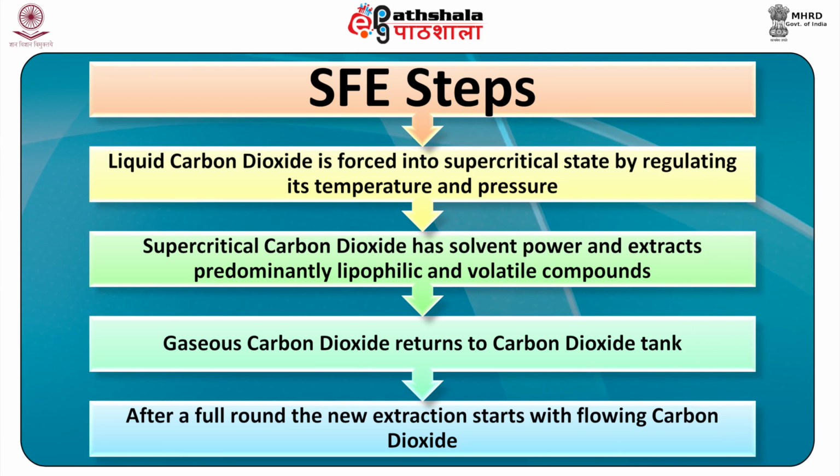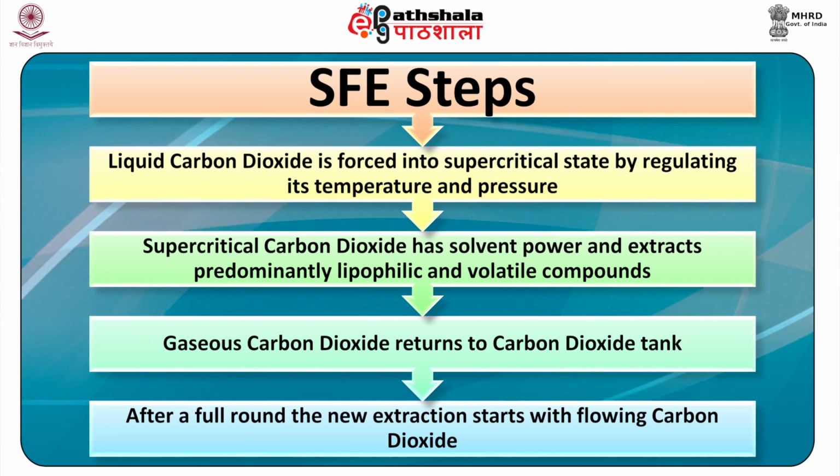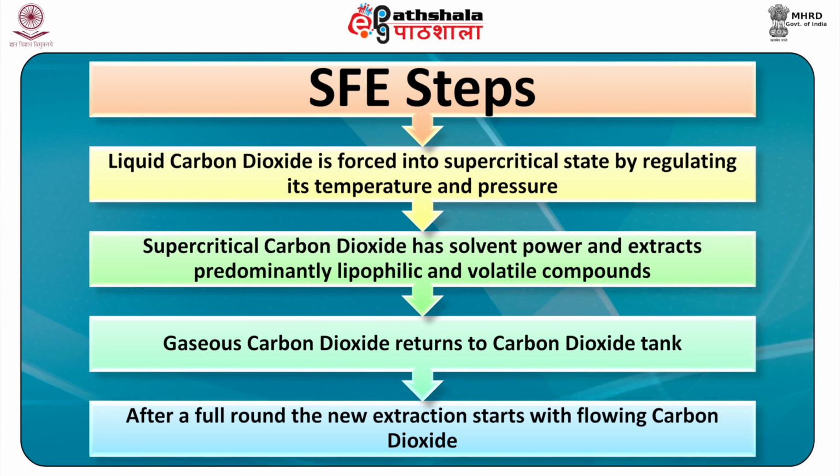The supercritical carbon dioxide has solvent power and extracts predominantly lipophilic and volatile compounds. The gaseous carbon dioxide returns to the carbon dioxide tank. After a full round, the new extraction starts with flowing carbon dioxide.